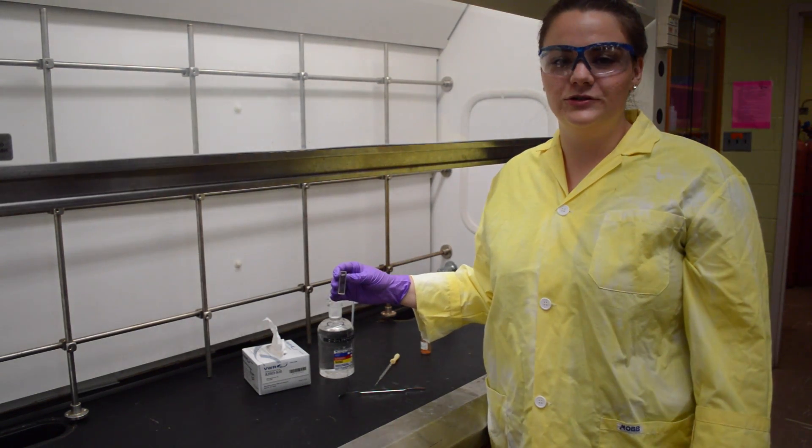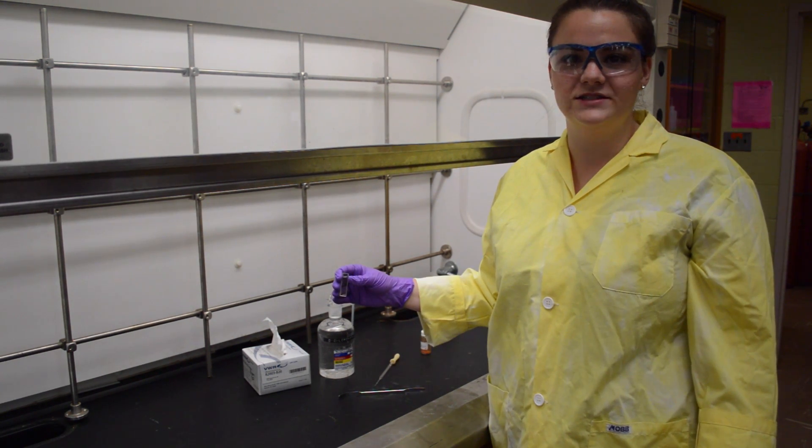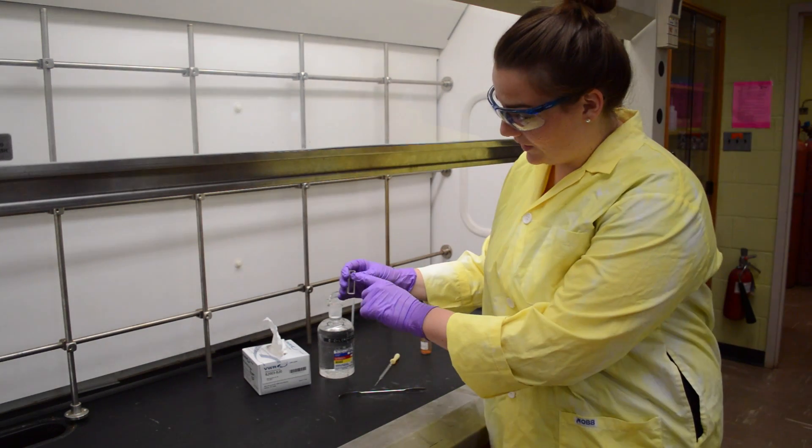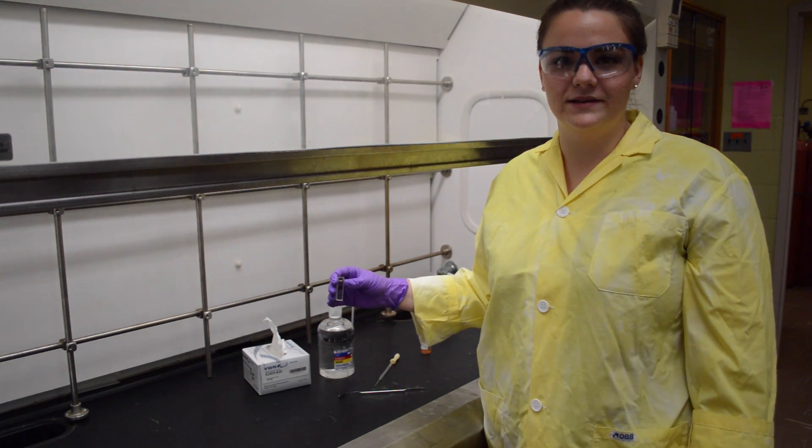If your sample is too concentrated, you want to pour about half the amount into the proper waste bin and add solvent back up into the top of the cuvette so the UV-vis spectrometer will read in the proper range.